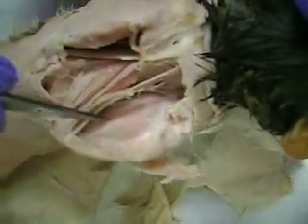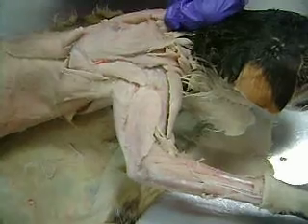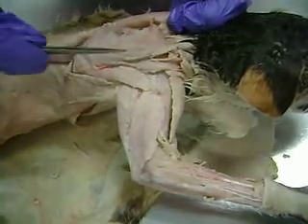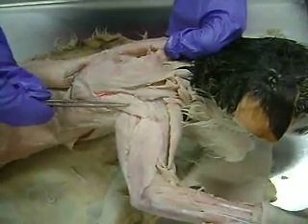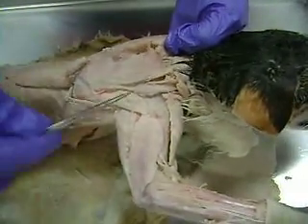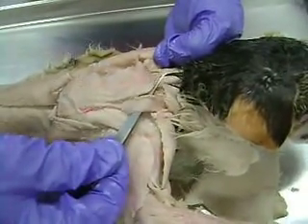Subscapularis would be this muscle in here — so underneath the scapula, subscapularis. One other one I forgot to mention in the upper shoulder: I said this was acromiotrapezius, and this is spinodeltoid. This muscle right in here is levator scapulae ventralis.